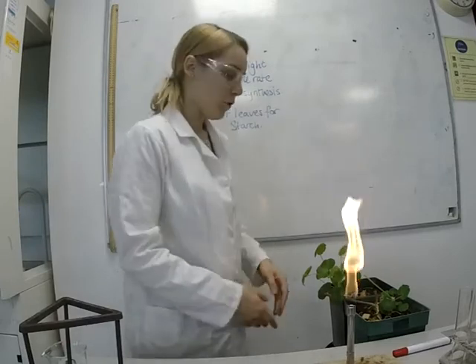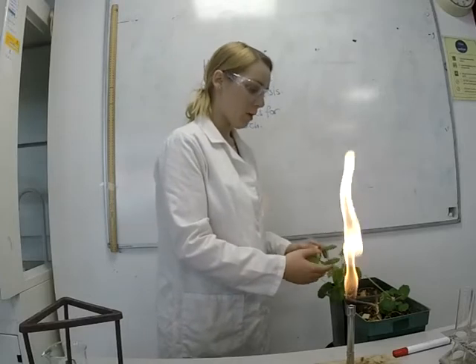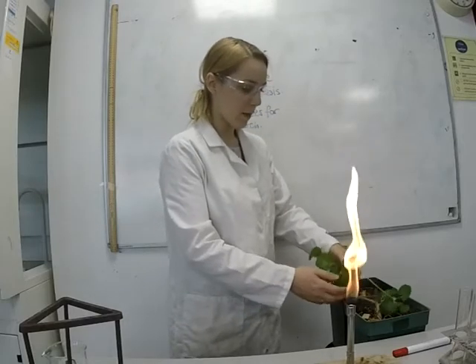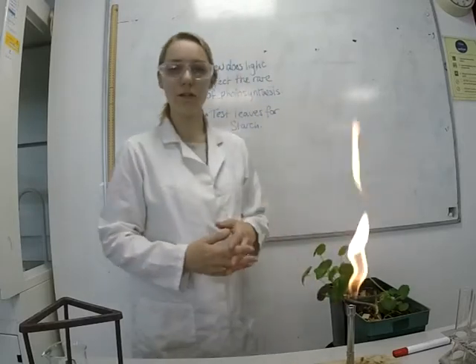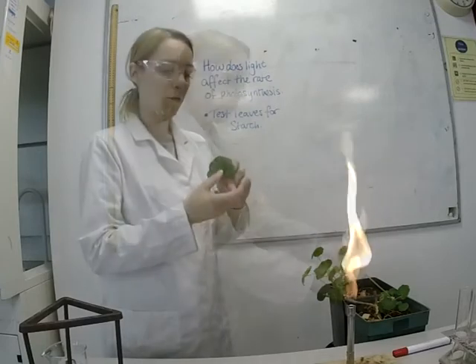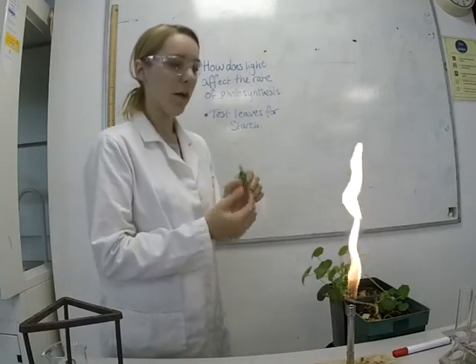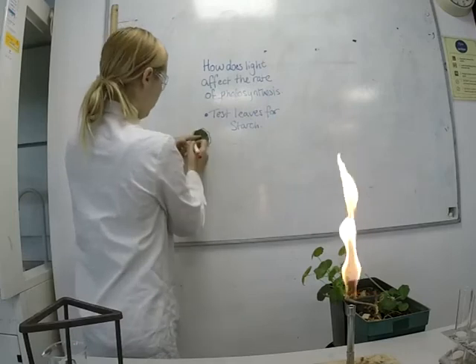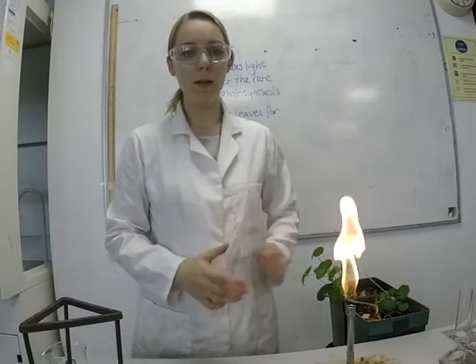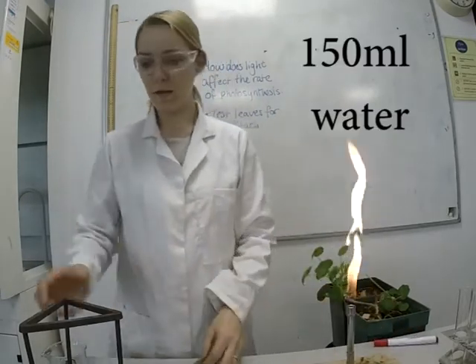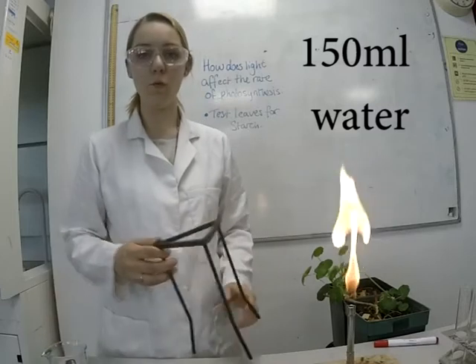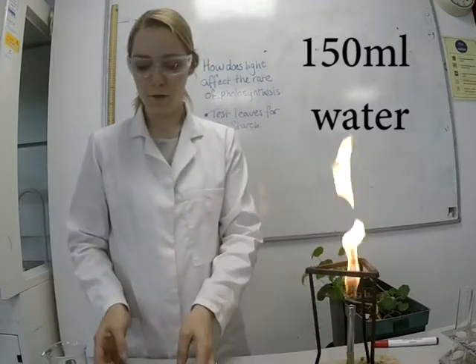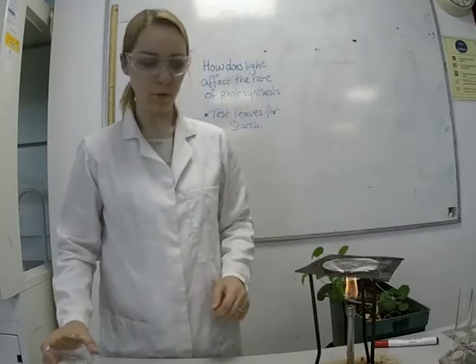First, take a leaf from either the dark or the light plant, depending on what your teacher has told you to do, and draw around it in your book. Then place that leaf in a beaker of boiling water for 30 seconds, so first you need to get your water boiling.